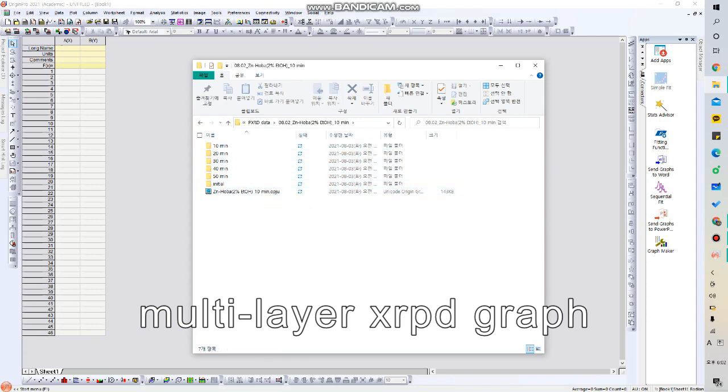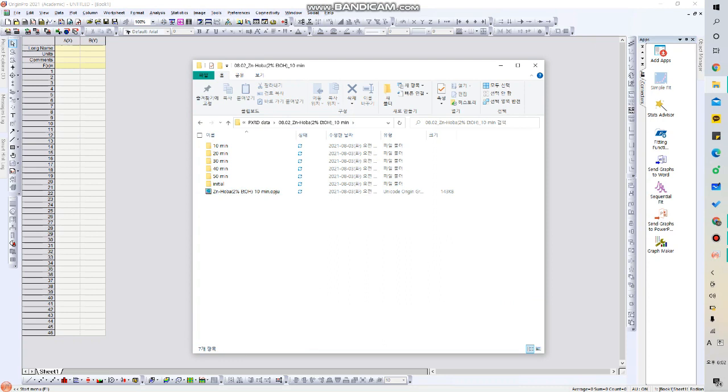These data are the ones that are made with zinc acetate as a metal salt and 4,4'-oxybis benzoic acid as a ligand. We tested if they are stable in water in a 10-minute interval. And we made a total of 6 PXRD graphs, and now we're going to put them in one graph and see if their intensity has decreased over time.